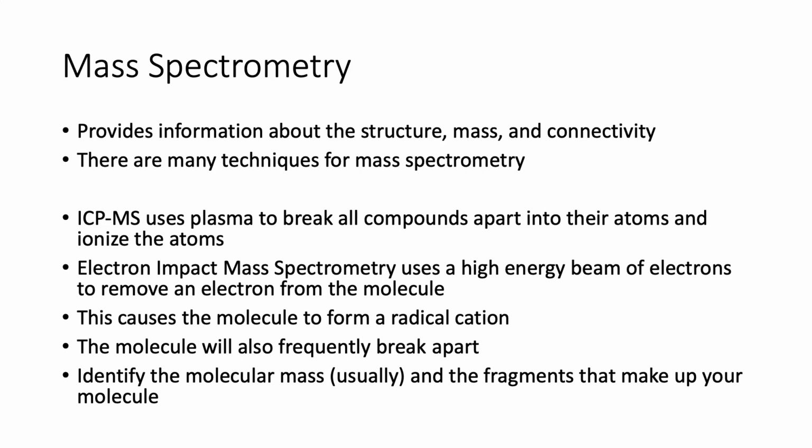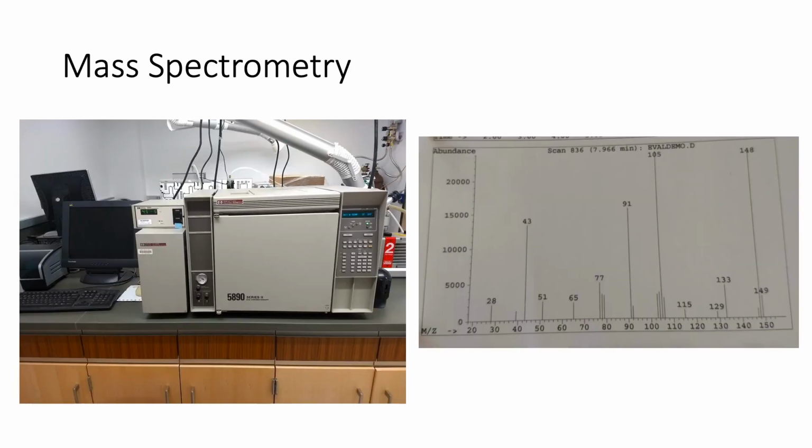So you can use either the mass of your molecular ion, and I'll show you what this looks like in a second. So this is what the instrument looks like.